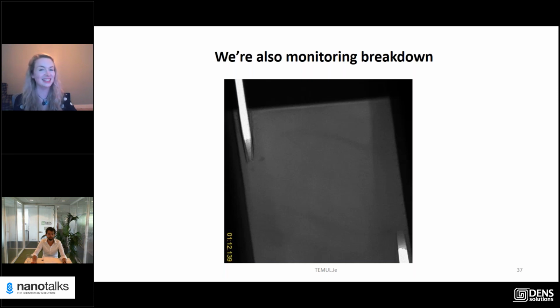Well, if it's a ferroelectric, I usually don't contact the electrodes. I do weld the lamella to the silicon nitride, but I don't contact the lamella specifically to the biasing electrodes. Another trick is that you can use only one contact. Even if you contact one of the electrodes, you don't contact the other. That would be kind of the best thing.